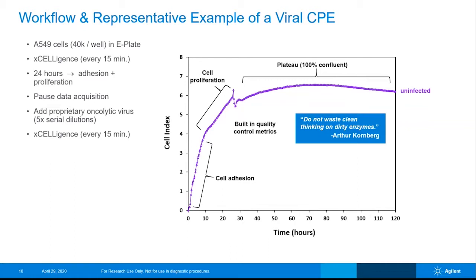If you're working with target cells that are unhealthy in any way at all, perhaps they're at too high of a passage number, perhaps the technician didn't split them regularly the week prior, and so they've been stressed and they haven't recovered yet, that absolutely has an impact on the quantitative information you extract from the assay. That's true for virology assays. And so what we and others have often done is use the untreated sample as a quality control measure to make a go, no-go decision in even running the viral infection.